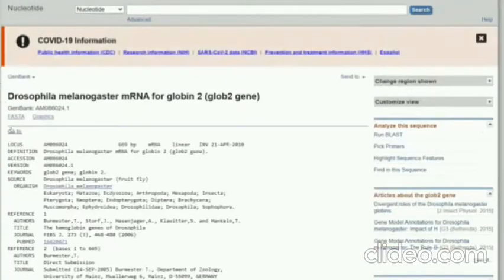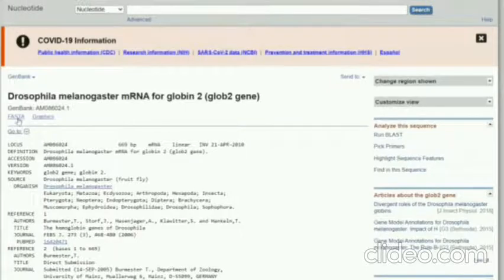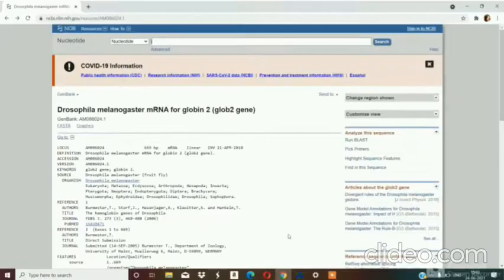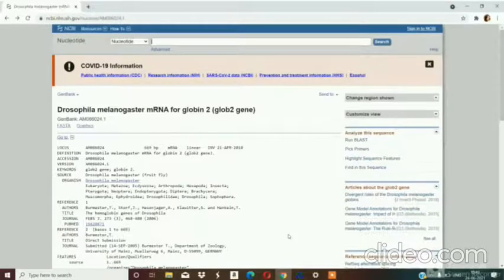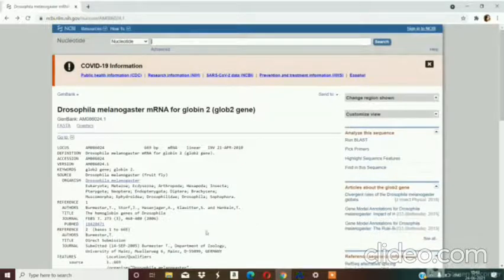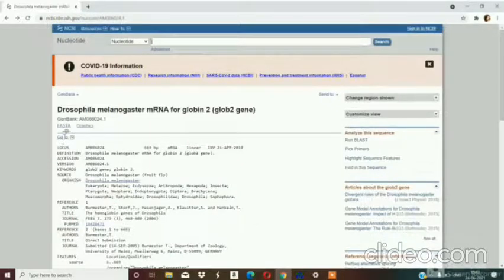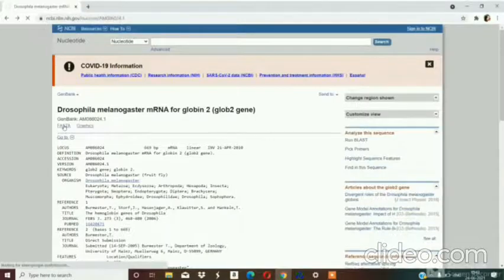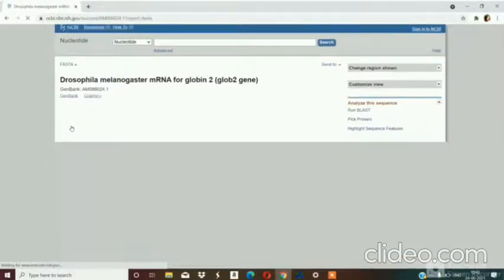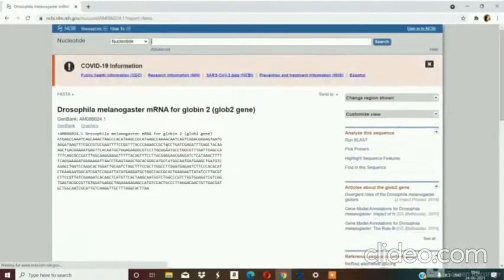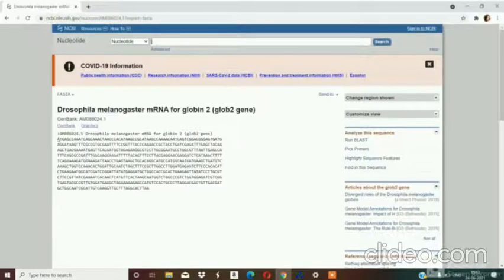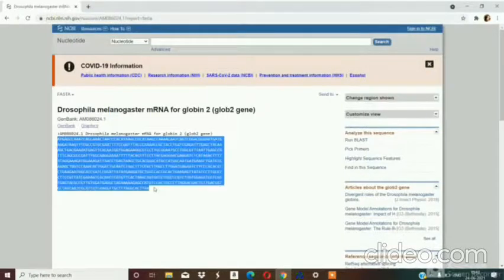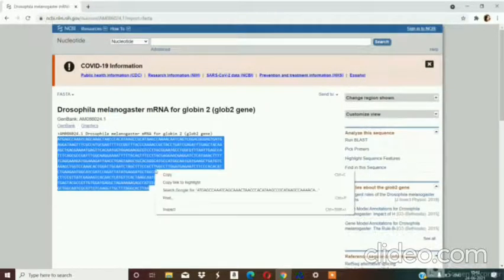This is the information for Drosophila melanogaster mRNA for globin 2 gene. Now I am going to click on FASTA. This is the sequence. Now we will copy the entire sequence.